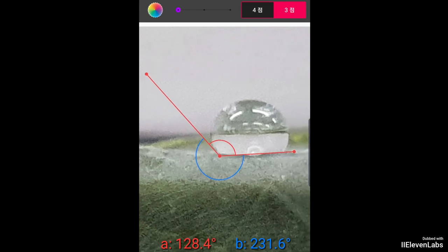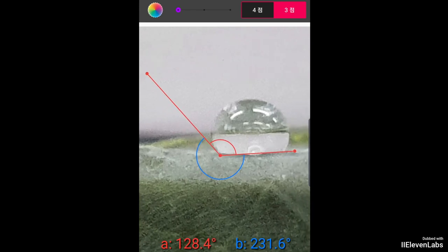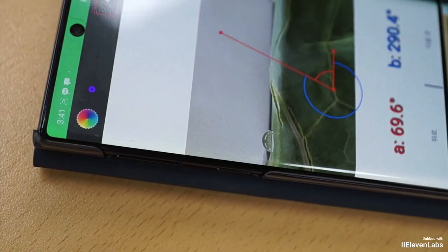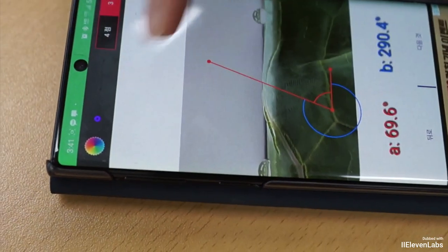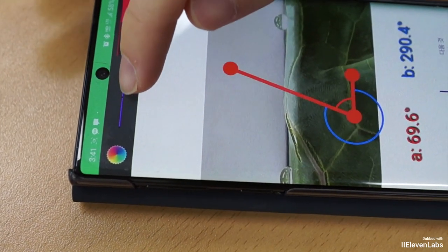It's important to take a clear and sharp photo of the water droplet. For a clearer photo, red artificial dye can be added to the solution. Another tip is to use a solid background color such as white to contrast with the red solution.